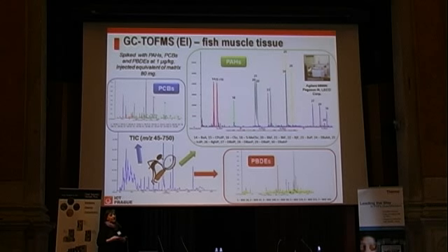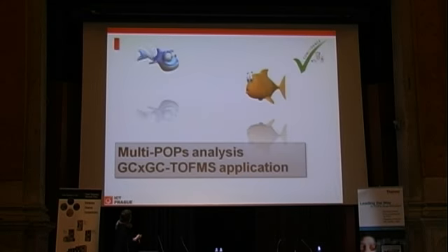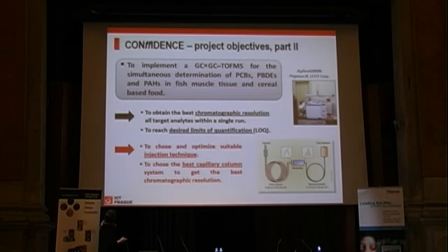And then, when we could see that the sensitivity, the LOQs, are not as low as we would like to have, we went to GC×GC to improve performance. Okay, so the GC×GC, what was the mission of that? We needed to improve chromatographic resolution, of course, and obtain lower detection limits, also because the sensitivity of the instrument we used at that time was not so good. We also had to play a little bit with injection technique. So that was another goal.